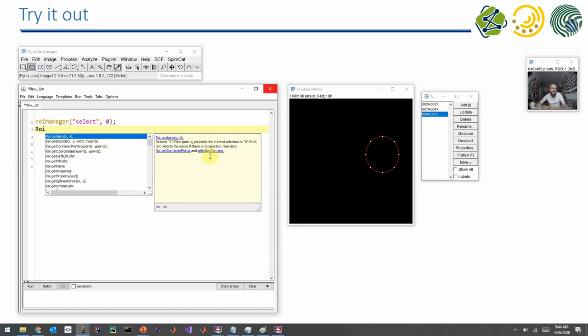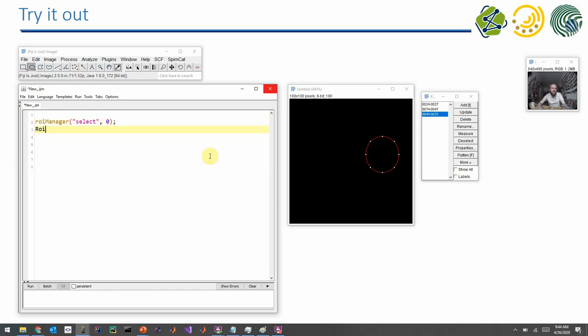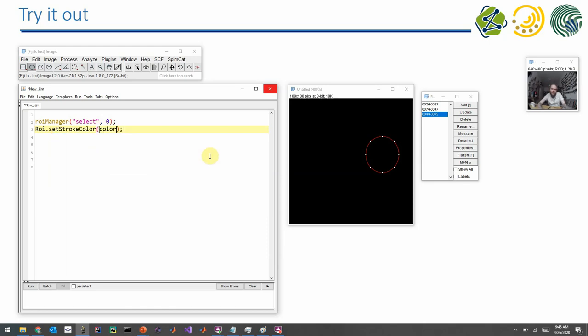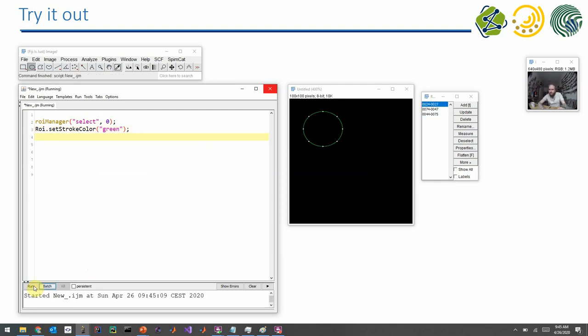And I make it green with the set stroke color command. And I just enter green. Let's see. When I execute this program, the first entry, number zero, is selected in the ROI manager and it's made green.